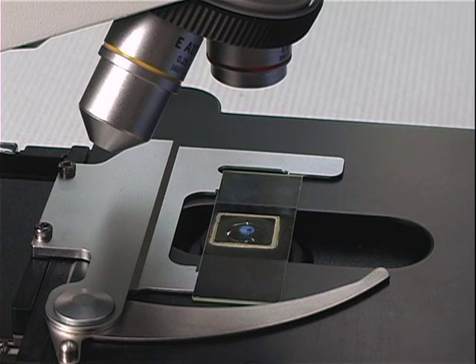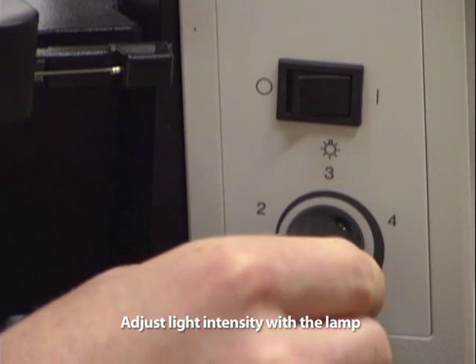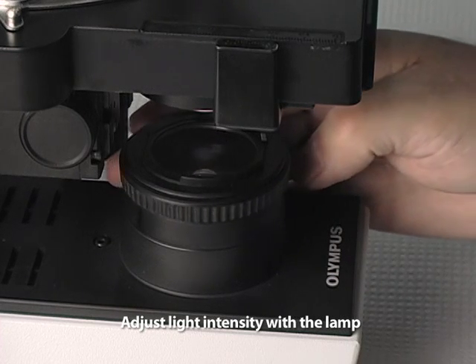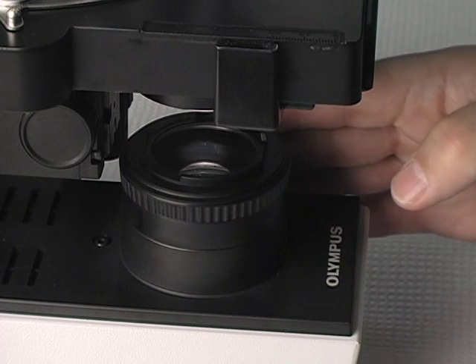The iris diaphragm of the condenser should not be used to adjust the light intensity. Light intensity should be adjusted by decreasing the voltage to the lamp or adjusting an iris diaphragm on the lamp. Generally, with higher magnifications, you will have to increase the light intensity.